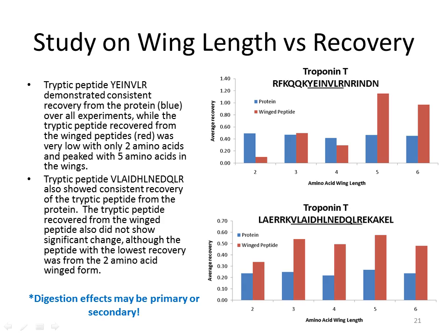This made us wonder if it was a very local amino acid sequence effect, like perhaps the individual amino acids and where they are located in proximity to that cleavage site control how quickly trypsin can go in and do its job to cleave and generate a fully cleaved peptide. So a lot of, you could interpret it this way. If you do decide to proceed with winged peptides, just be careful. Make sure you have in your mind all the potential experiments you could do and think about the potential outcomes so that you have a good way to interpret them.